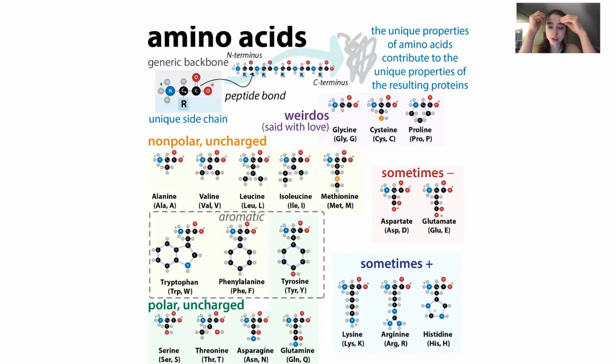When we look at the models where we just see those sticks, we can't tell that unless we color it by B factor. But if we look at the actual electron density map, we can see that those regions tend to be fuzzier and harder to make out, like where the different side chains are. So I want to show you an example of how you can look at the electron density and show you what I mean by things like B factor.